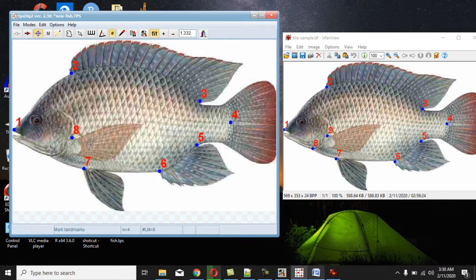The ninth one. Sorry, this one is the 8. Now there's a mistake here already. So how would I do now? I have to correct this, but how do I do that? I need to move these two. So I will now go to this editing tool. Okay, I click here.